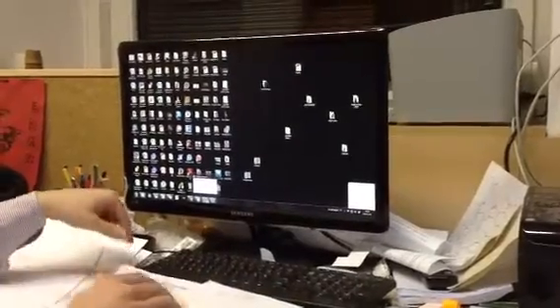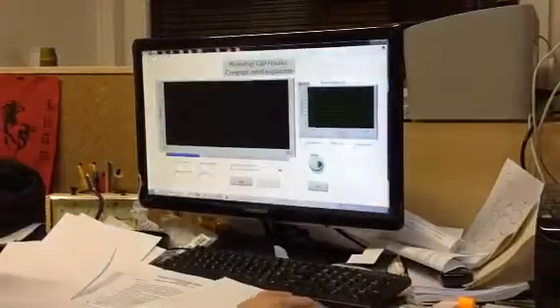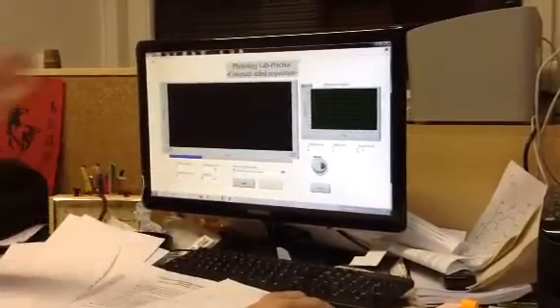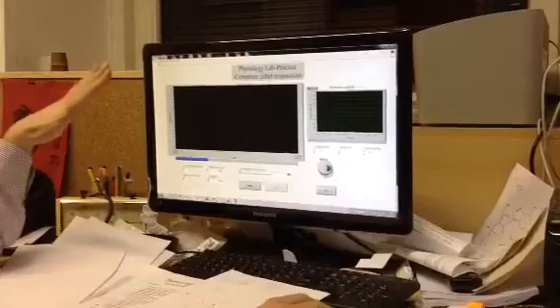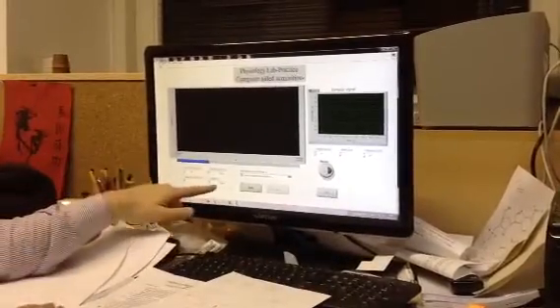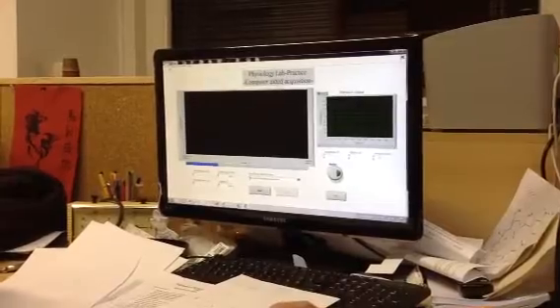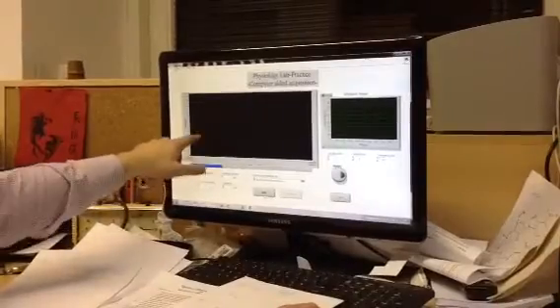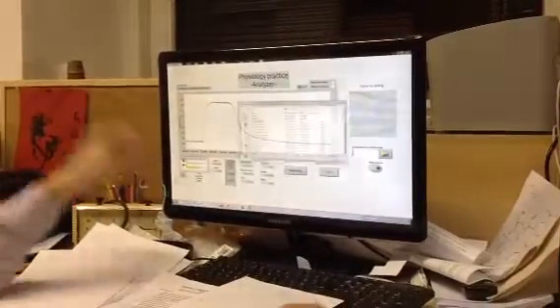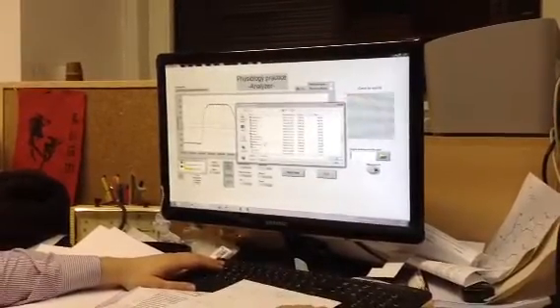As you have to do for 5th and 6th. Then set the sampling rate to at least 100. The length, in that case, is not important. For the uterus, it's important to be 1,200 seconds, 20 minutes, because you need that. And then you run it by start and put on the weights. Wait a bit till you have the constant phase. I can analyze it.